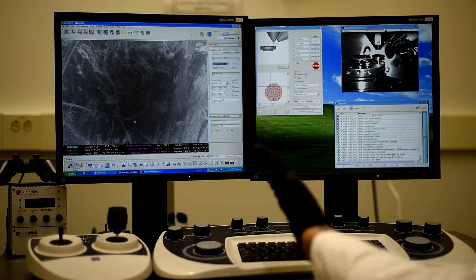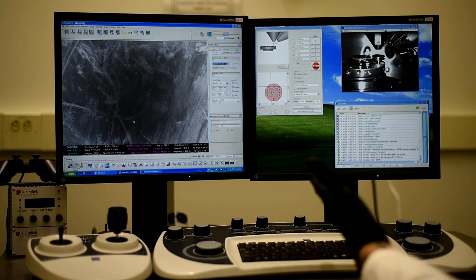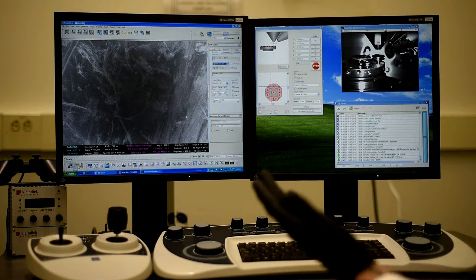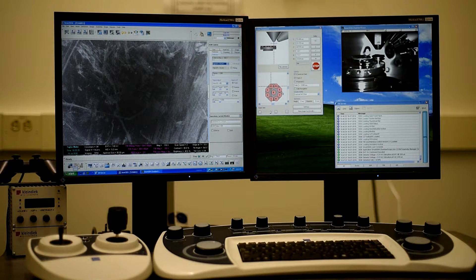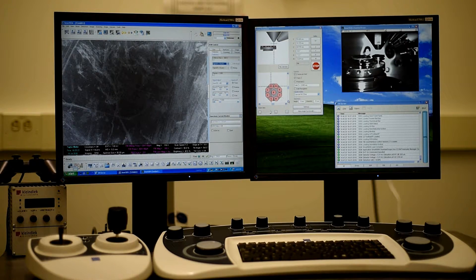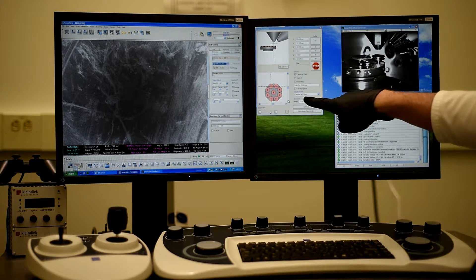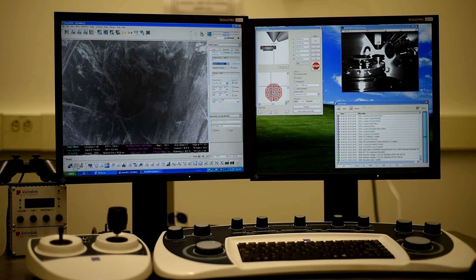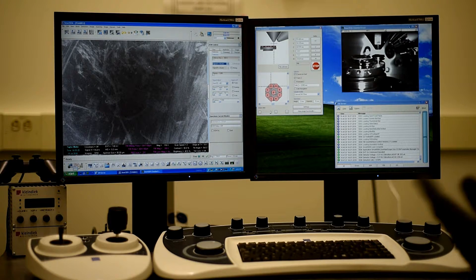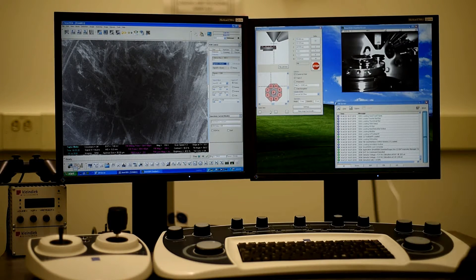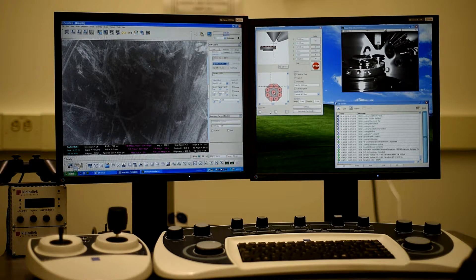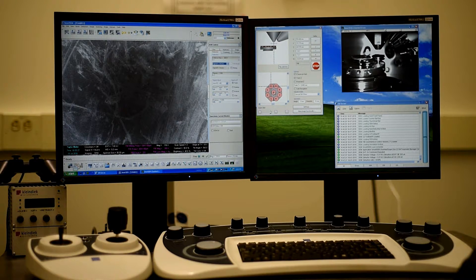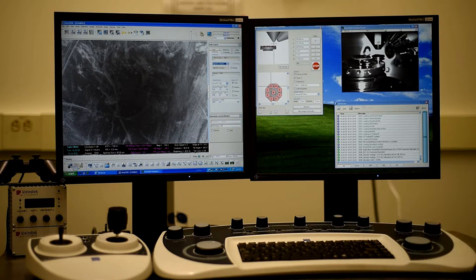So now let's move to the dime. I loaded the dime in position zero. So if we go to the stage navigation screen, and I just double-click zero, which is the center position. And I first need to note, am I going to crash into anything? Well, I can see here I've got plenty of room, so that's fine. I'll double-click the zero.